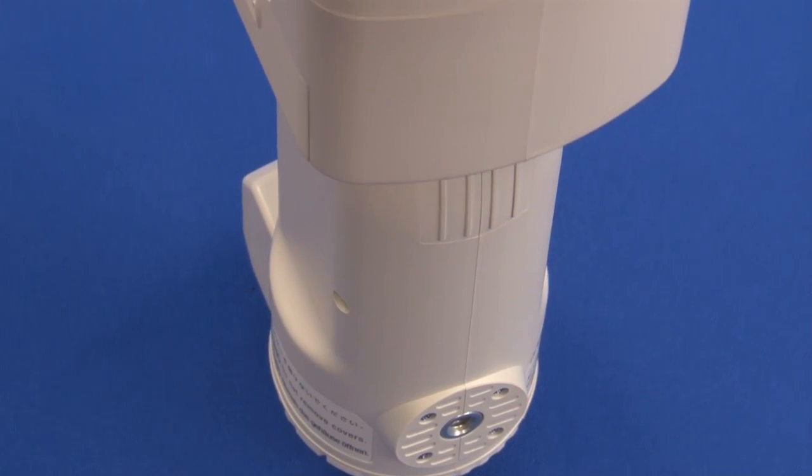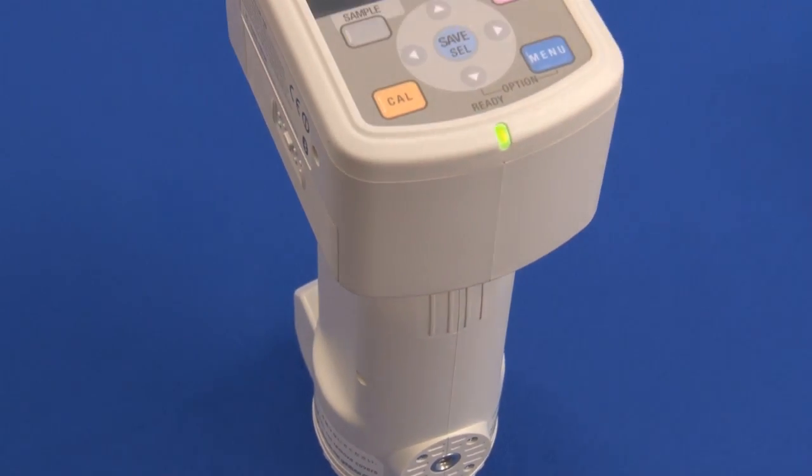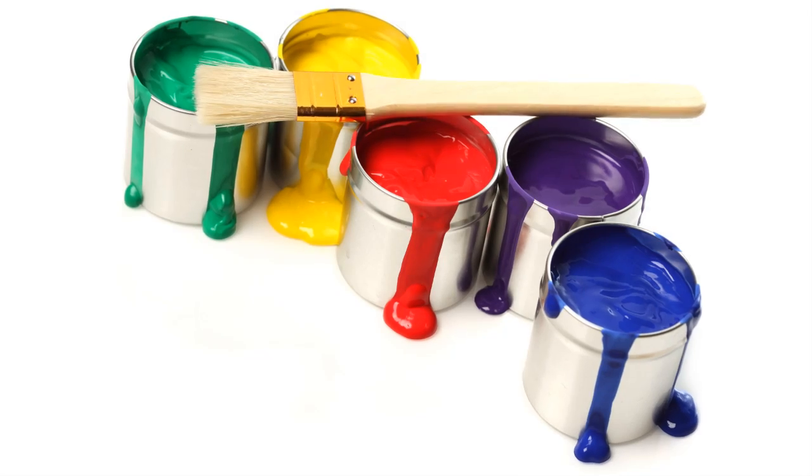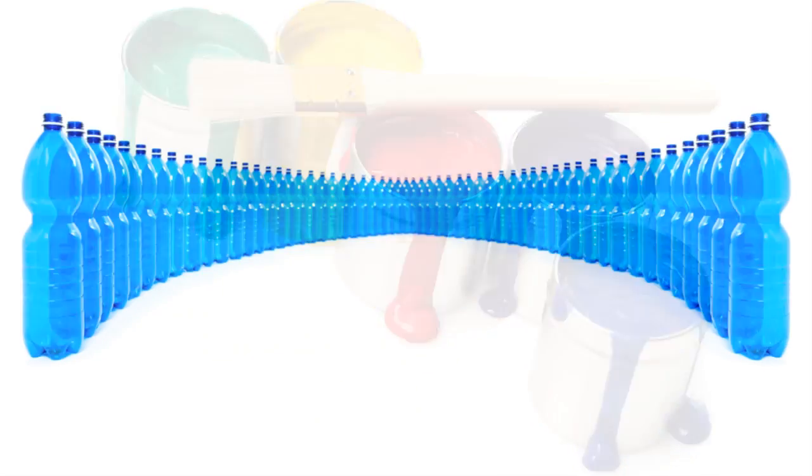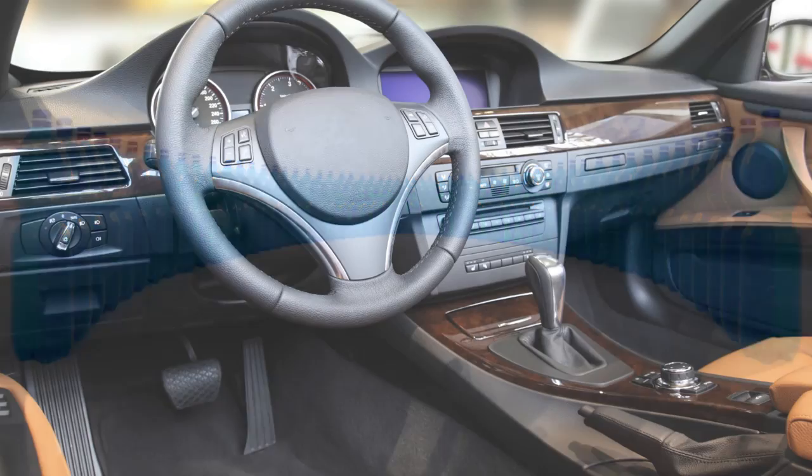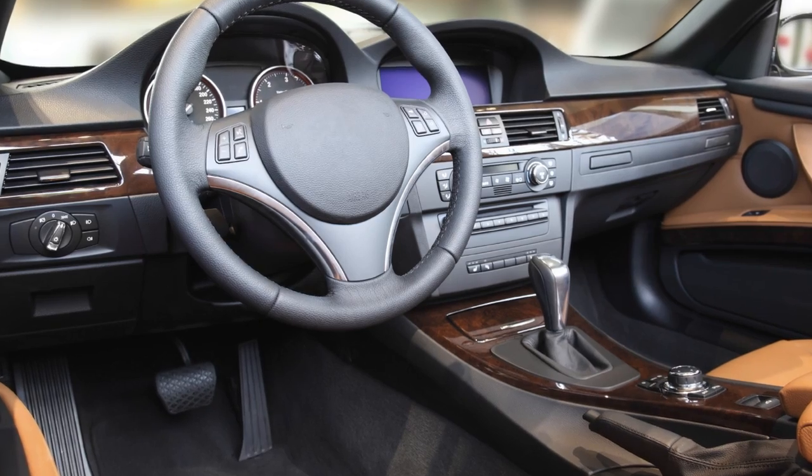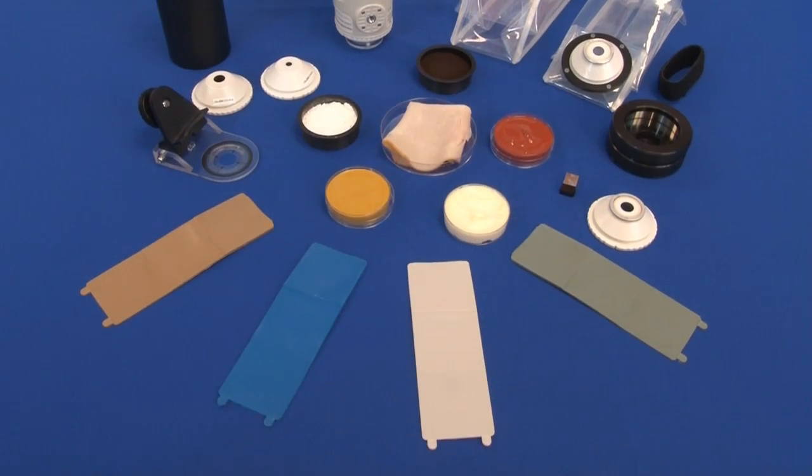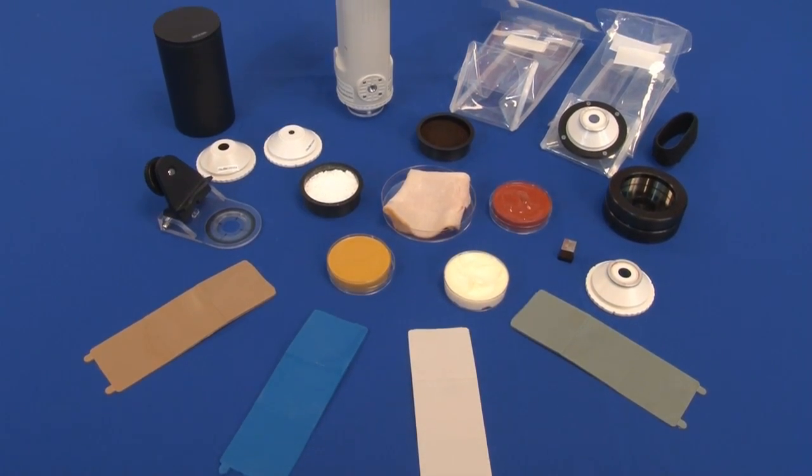The CM600D and 700D spectrophotometers are easy-to-use color instruments ideal for measuring paint, plastic, and automotive products. They provide highly accurate measurements to ensure color standards are being met throughout the manufacturing process.